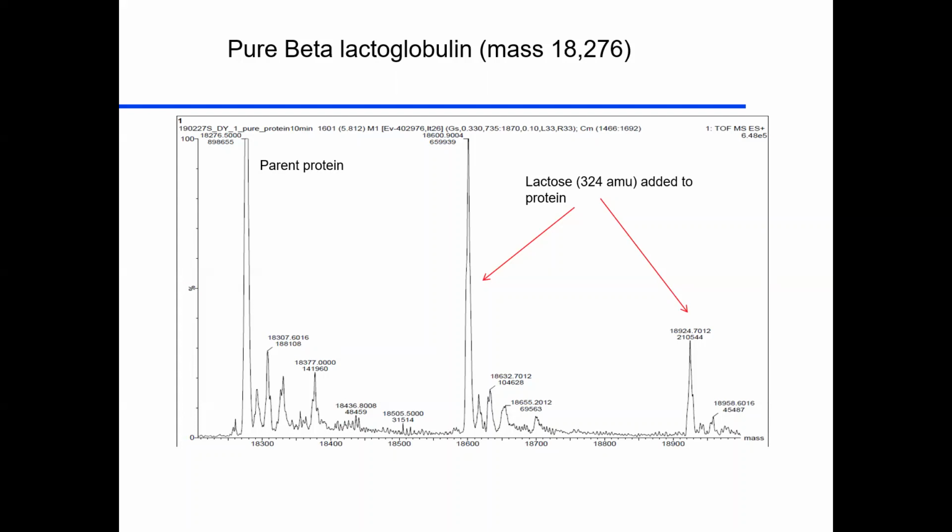There's beta-lactoglobulin. There's some oxidation of that protein, so we got smaller additions onto here. Once you know, lactose will add on. We get some browning. We produce a little bit of lactose added on to our protein, maybe one lactose, maybe two lactoses. But our mass spectrometer says, here's a protein, here's some oxidation products, here's your first lactose or second. We can count the number of lactoses being added on for browning. So that's really nice.